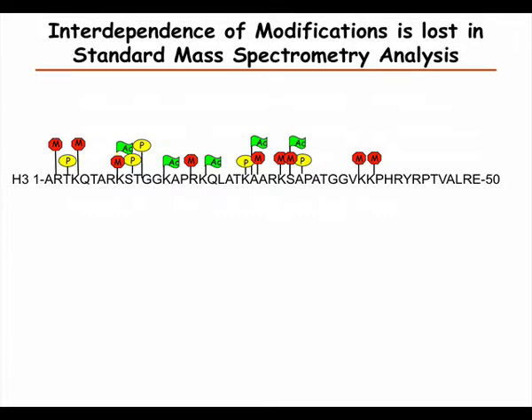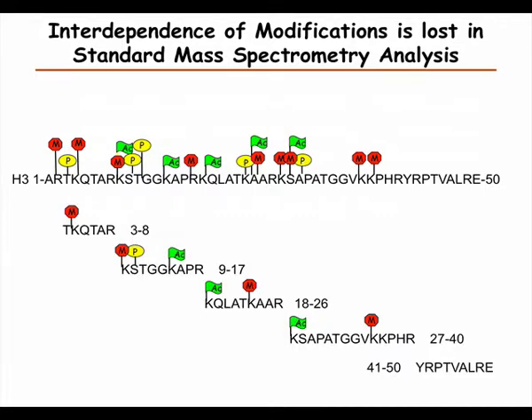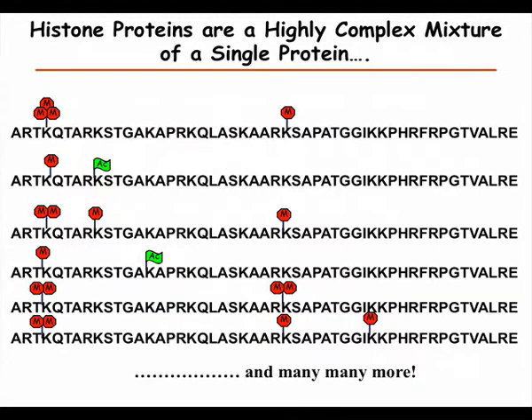Again, if we do bottom up, we lose the long-range correlations, which in this case for histones we do want very much to know. So it's better to look at, not the whole histone, but people usually look at the cut after the first 50 amino acids.